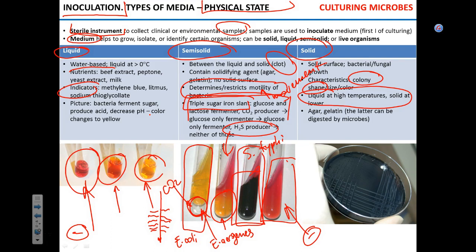So using these slants, you can distinguish between three different bacteria based on the appearance of the slant. People have actually made a whole array of various semi-solid media in tubes, and by how the slant changed color, you can identify precisely what kind of bacteria it is. We're going to do this. We're going to do this lab. We're going to try to identify microorganisms.